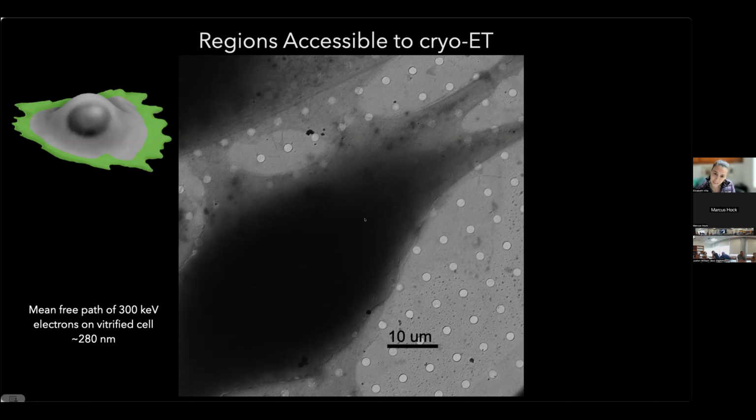This is a mammalian cell. We're growing this in an EM grid. So for those of you that have seen EM before, these are 1 micron holes. They would have hundreds of molecules for single particle cryo-EM.